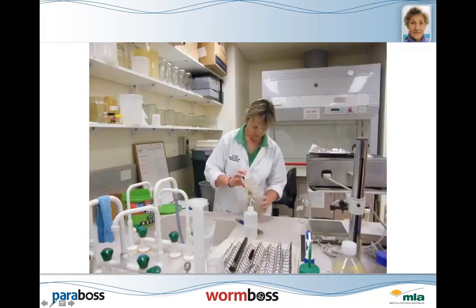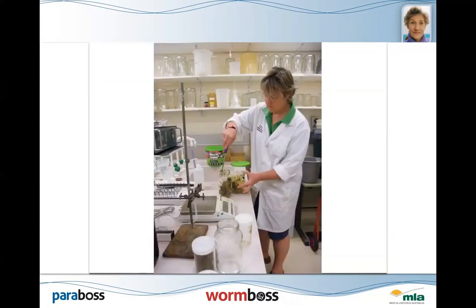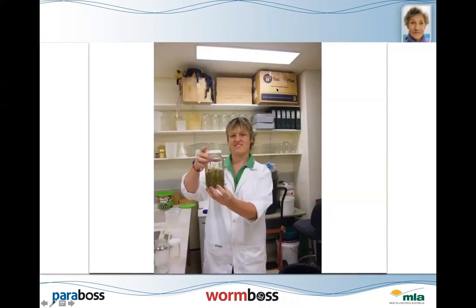Let's get that. Add a bit of water to it, give it a thorough mix, and then once that's done, it goes into the jar. When we've done that, fill the jar up, we put that into an incubator, and then that goes for about 7 days.